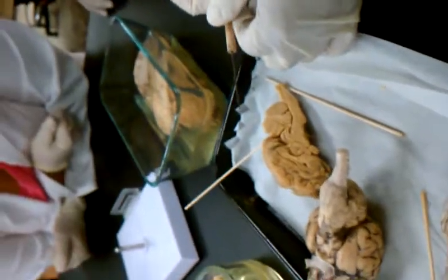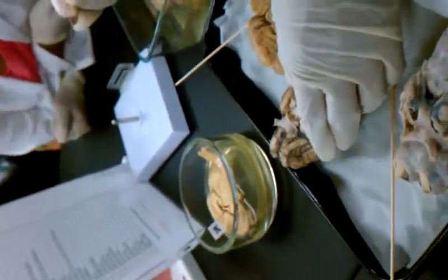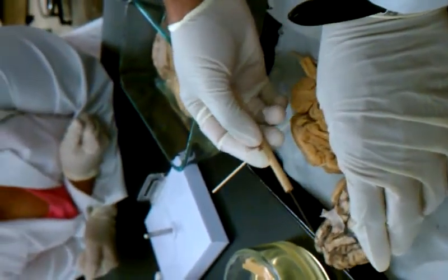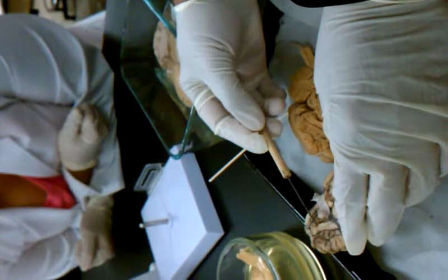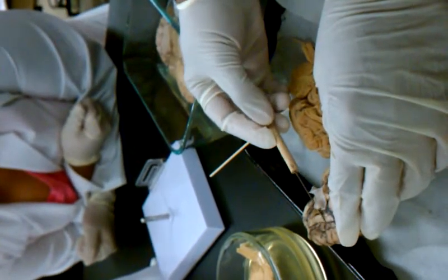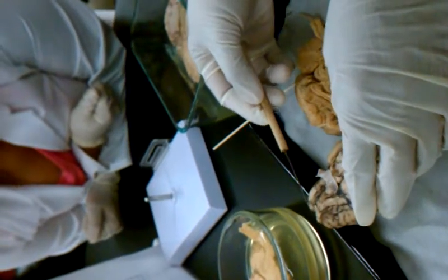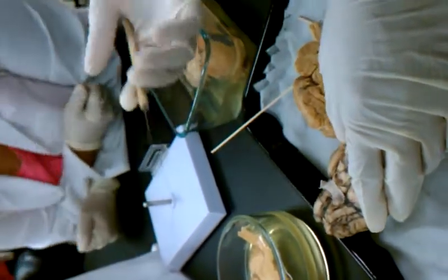Okay, 17. No, 16. Olfactory tract. Tract is like the path of the nerve, so this is all your olfactory nerve. The structures belong to the olfactory nerve, so the path is the tract. Path of the nerve. This bulging structure, the bulb, that's your olfactory bulb.